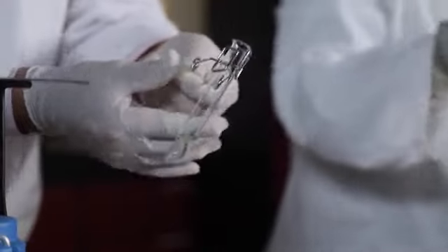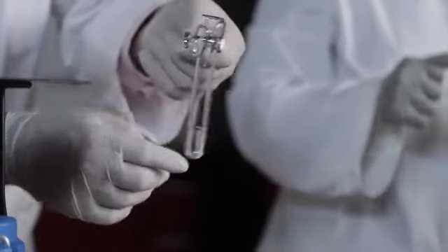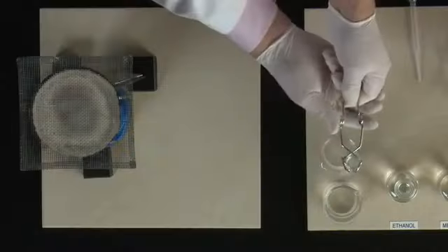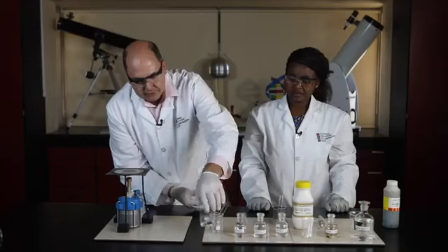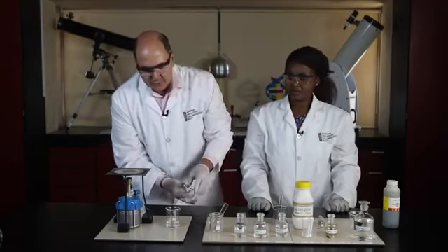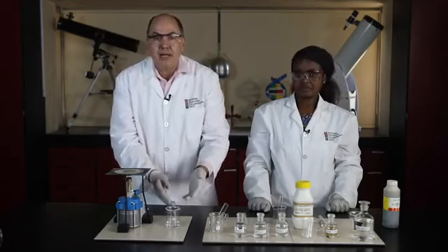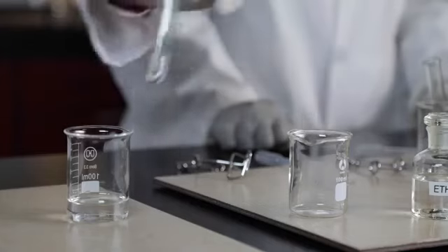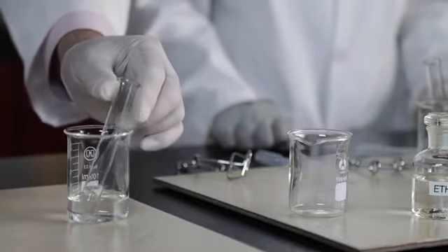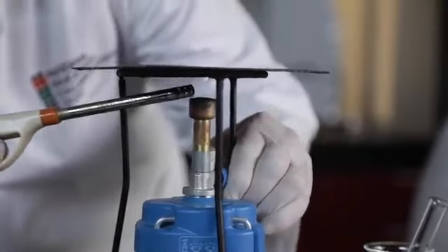Lovely, lovely. Swirl it. It doesn't look like much is happening, but this mixture is starting to get hot. I'm going to rest the test tube in this beaker over here for a moment while we get our water bath ready. So we've already added about 10 ml of water into this beaker, and we're going to now take our test tube with our reaction mixture and place it into that beaker. It's time to light the Bunsen burner and get the heat going.